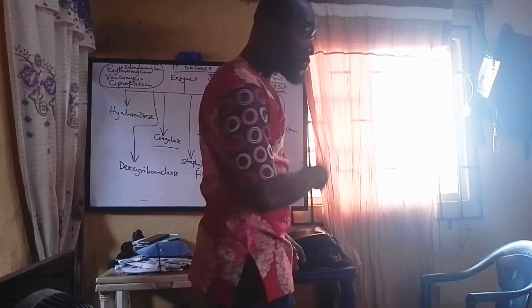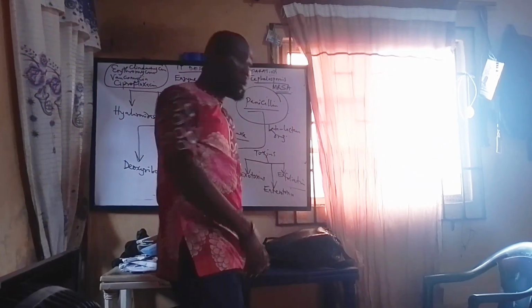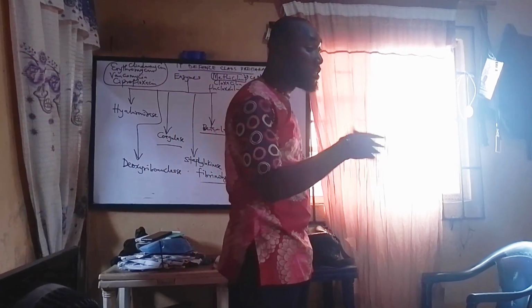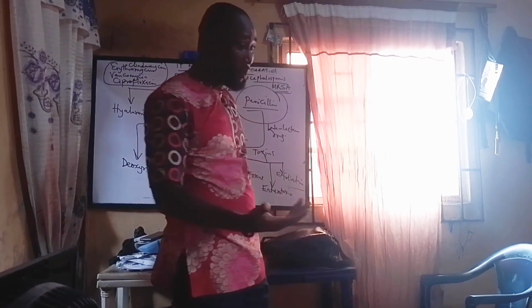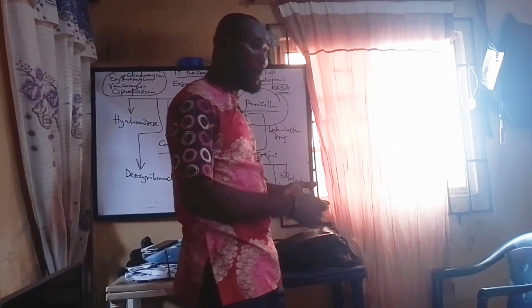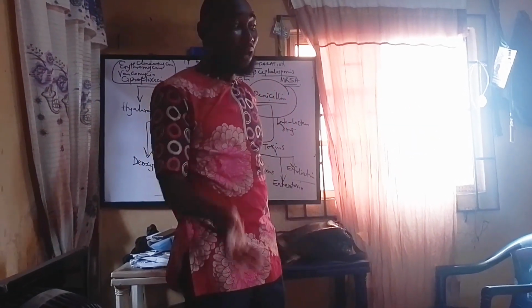The inoculation, they will ask you which kind of method are you using to inoculate? Is it the streak method? Is it the spread method or the pour plate method? That pour plate method is majorly used when you're dealing with urine. But when you talk about solid samples like maybe discharge, you can decide to use streak method. You can't pour because you are using a stick swab to collect the sample. Hope you know because that's the technicality.